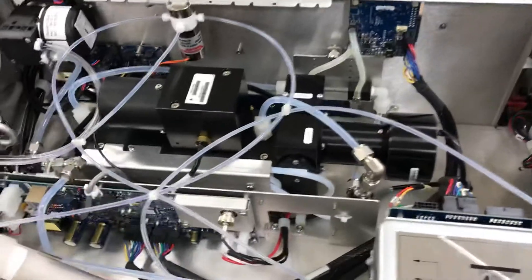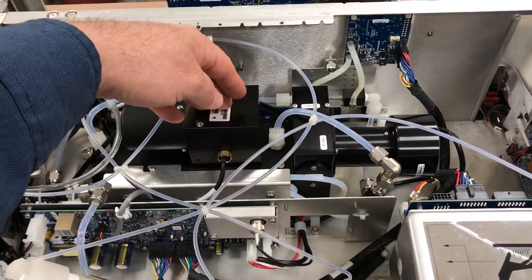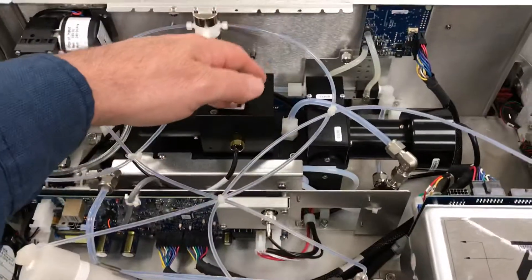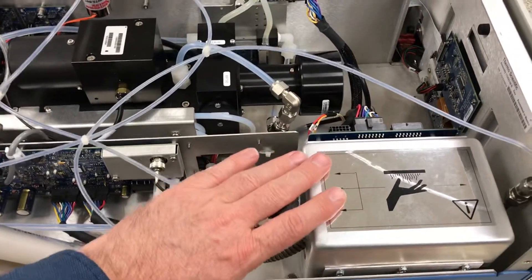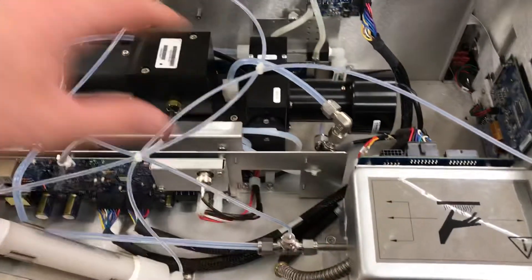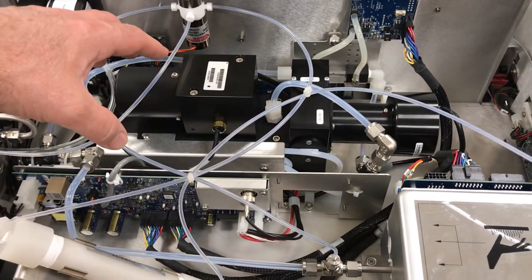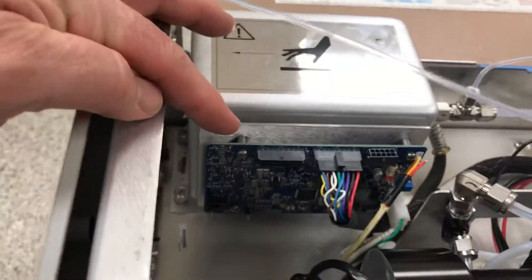Coming around the side, there are plenty of changes to look at in this analyzer. They've centered the reaction cell assembly — a great improvement. It used to be up tight against the panel; now it's centered. The H2S converter is now a square can on the side of the instrument. It used to be a round can on the back. It has been brought up to the front of the analyzer and has its own temperature control board.